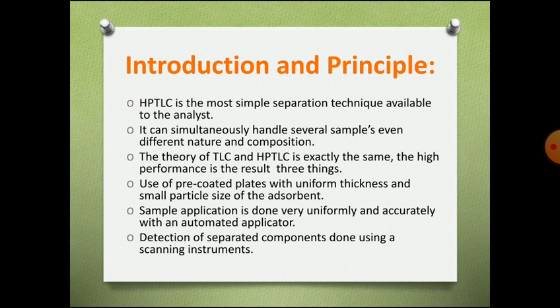That is why it is called high performance thin layer chromatography.